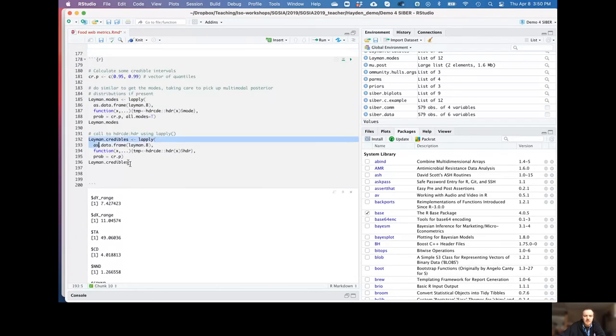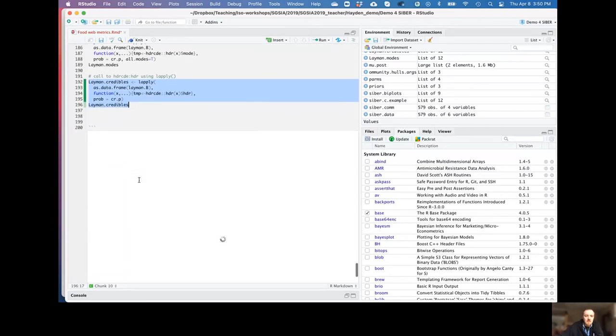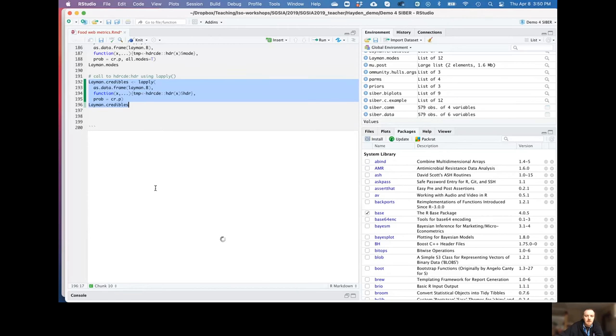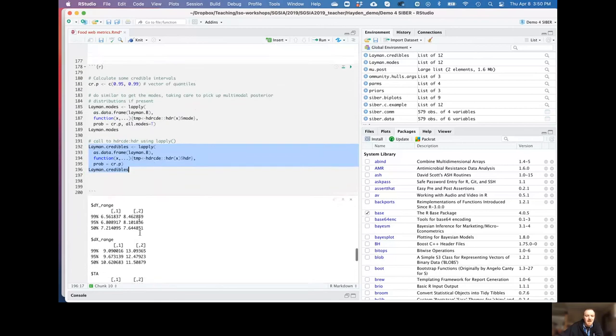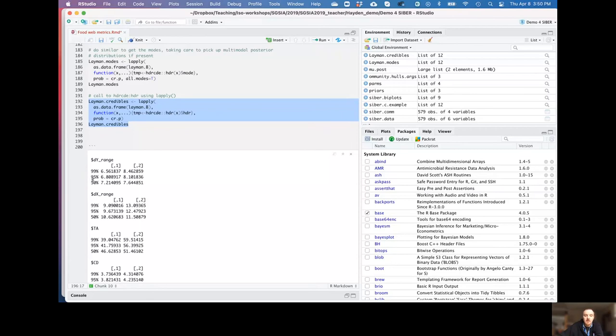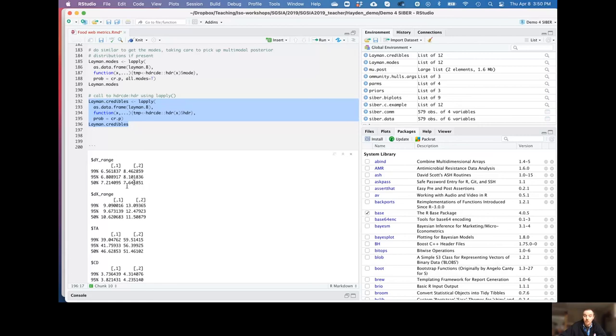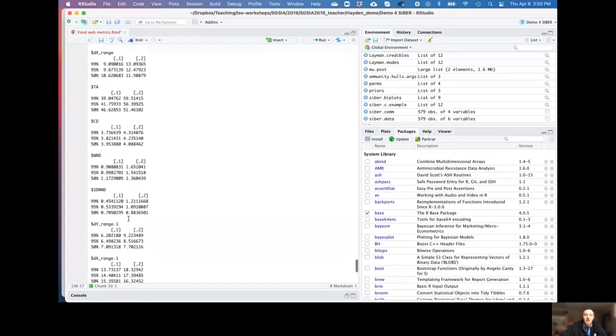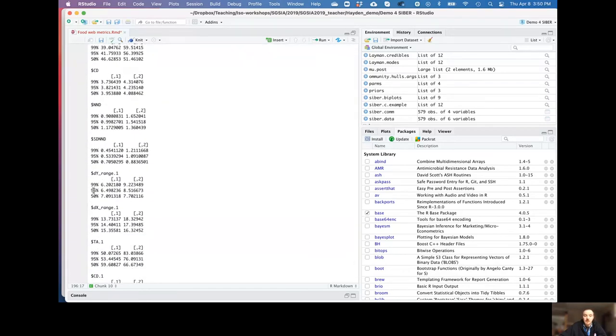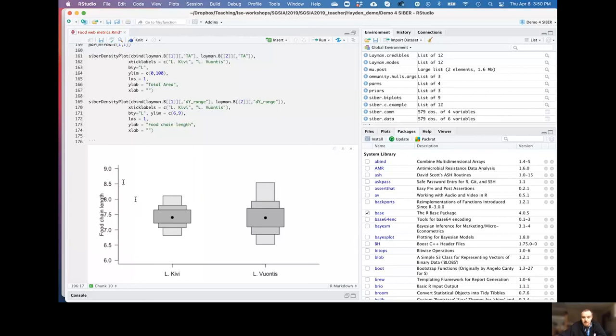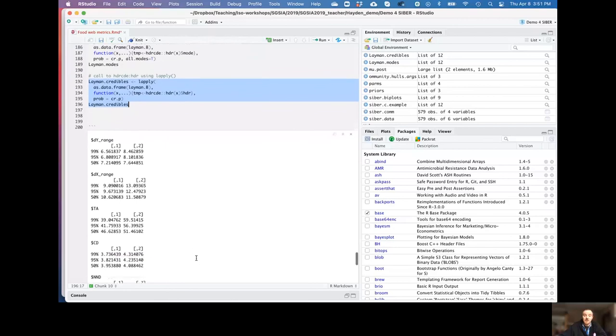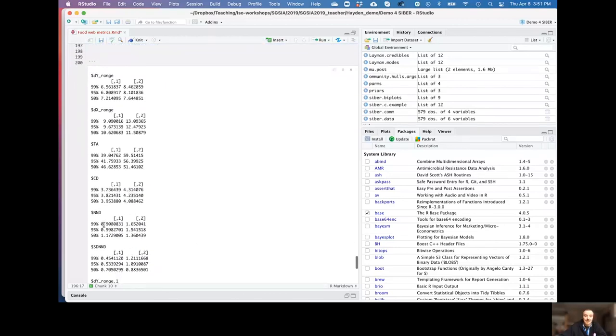And then we could do the same thing here for our credibility intervals. Pull those up instead. And what we should see is Y range, lower and upper 99, 95, and 50% credibility intervals. So that's confidence range around those mode values. So 95% certain that the dY range, food chain length in system one, Lake Kiwi, is somewhere between 6.8 and 8.1. Scroll down, and we get the same values for Lake Vauntas, 95% certain, somewhere between 6.5 and 8.5. Scroll back up. Those values pretty much match up with what we see, and we're getting that output directly from the SIAR package.